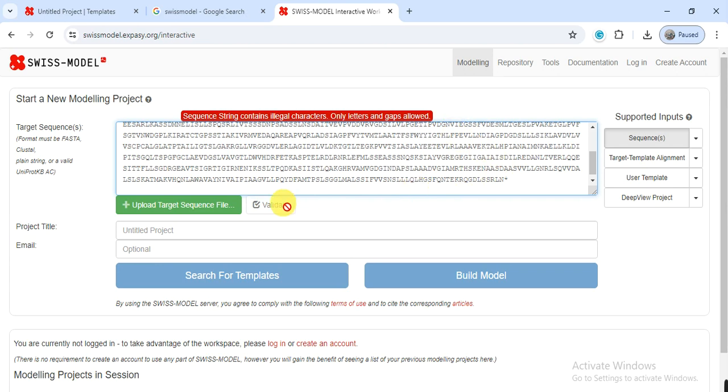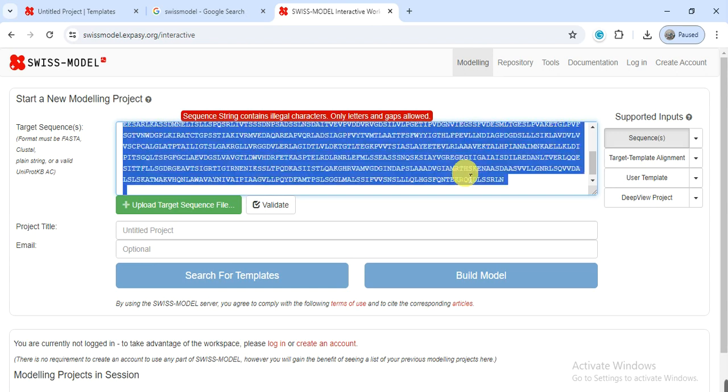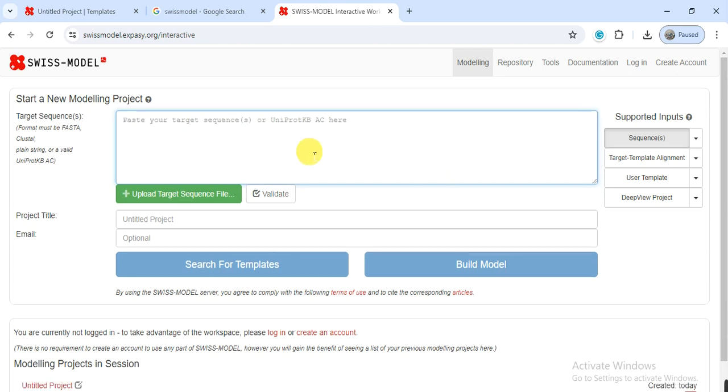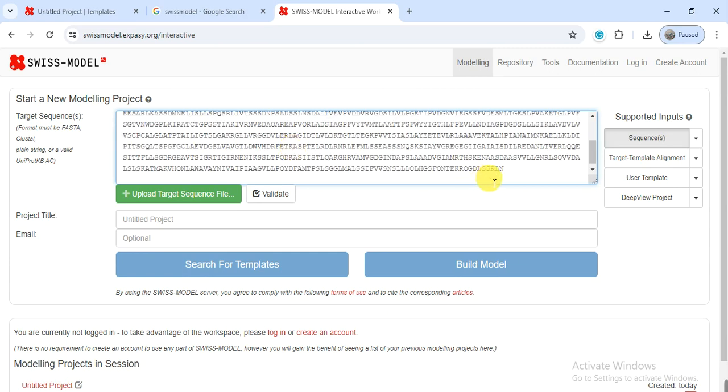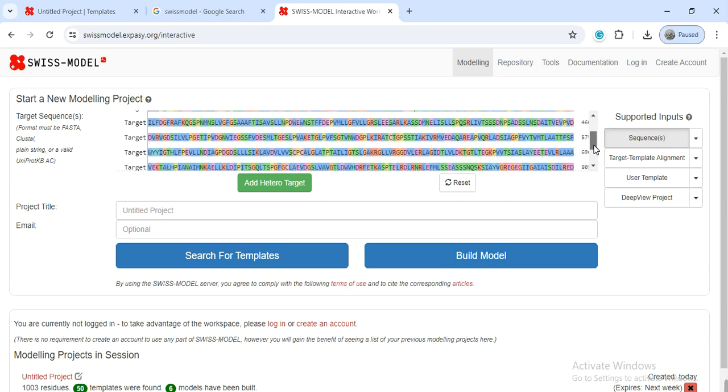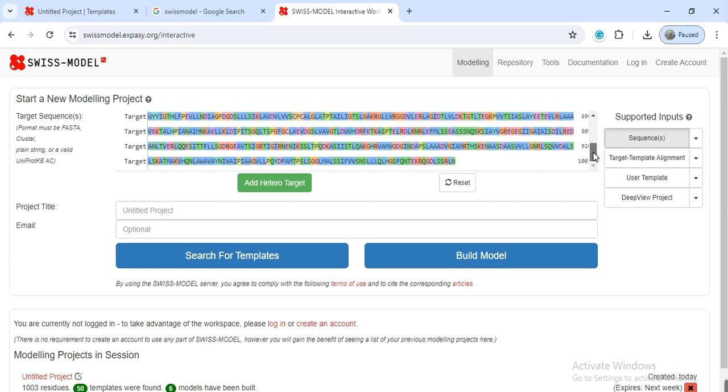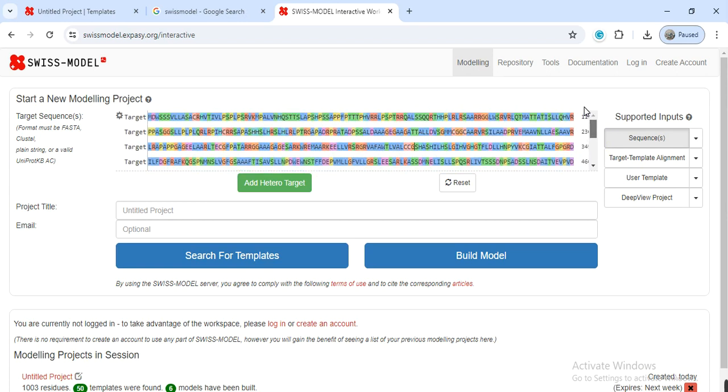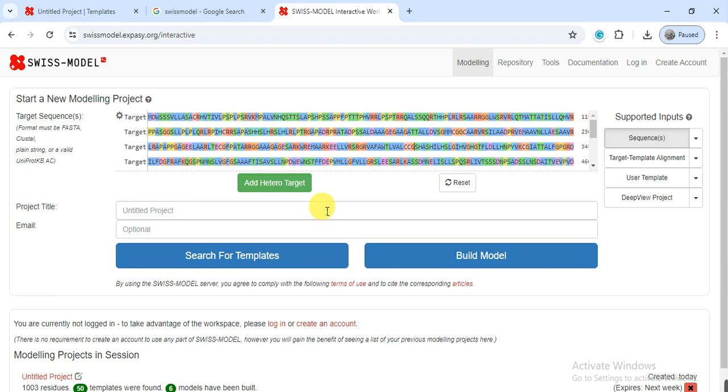Here I have some mistake or something wrong in my sequence. Here, this is the star, so now we delete this and paste again. Now it has taken. If your sequence has a star or something else, so you have to delete it and then click on build model. If you want to give the name or email, you can or simply click on model.